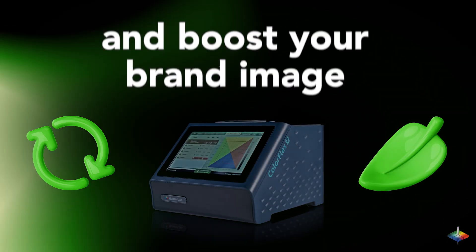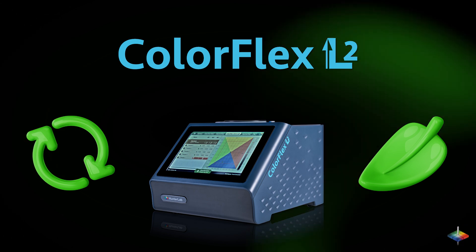Reduce waste, contribute to sustainability, and boost your brand image with the ColorFlex L2 Spectrophotometer.